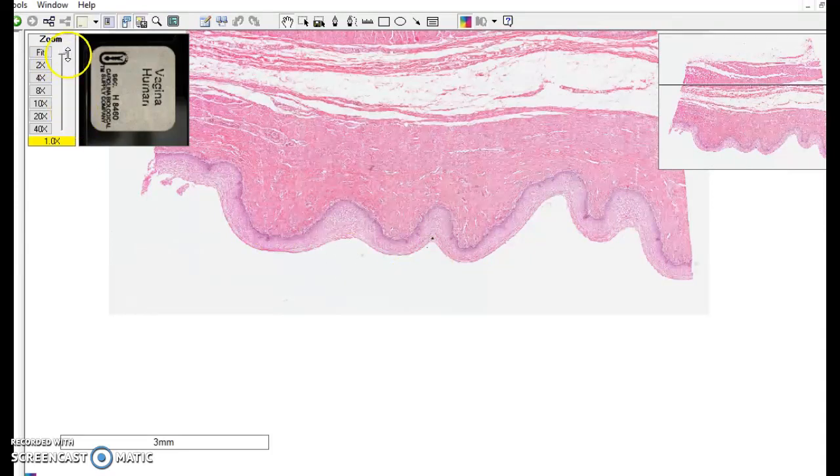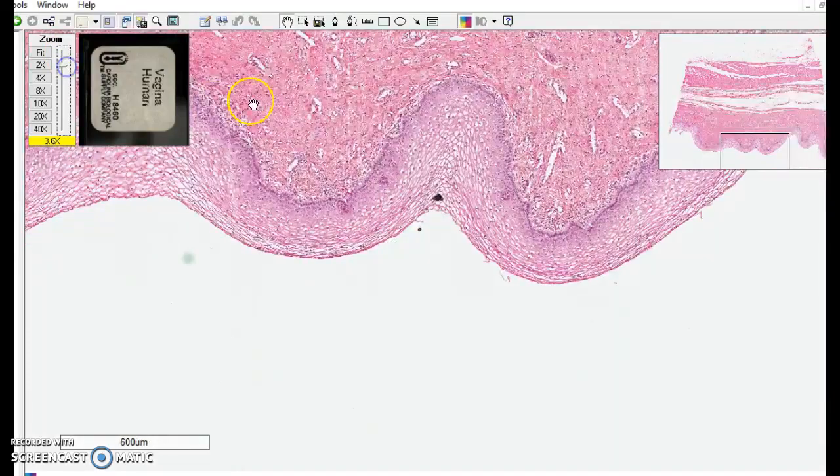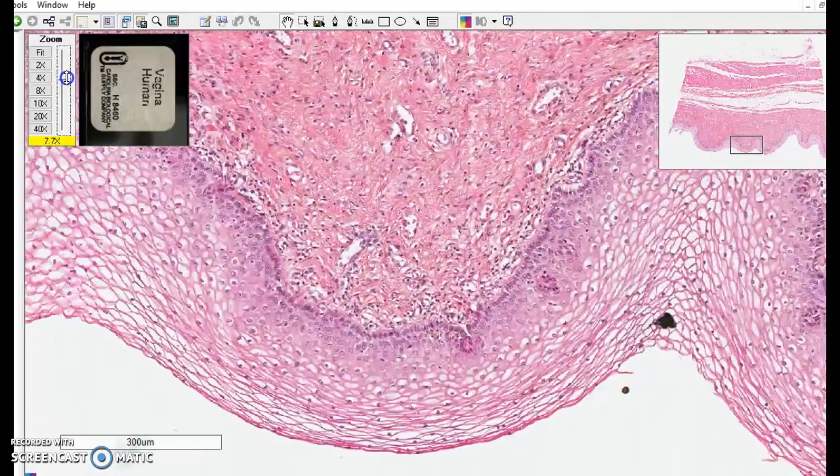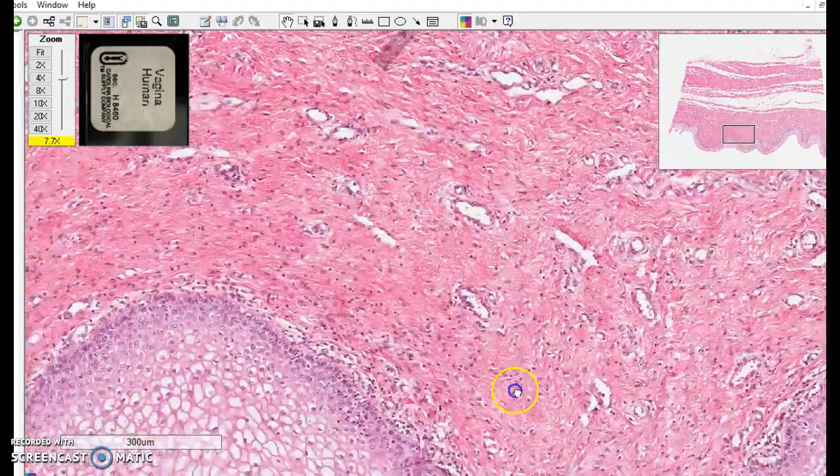Let's take a peek a little bit closer up so we can see some cells, maybe even closer.